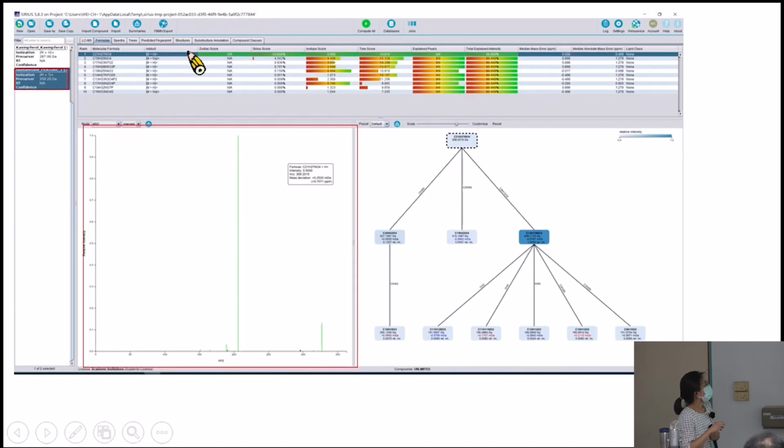But if we upload another spectrum data here, and likewise assign the conditions that we are using, you will find that there are multiple potential targets, which means that all of these are probably similar to your mass spectrum data, your sample.